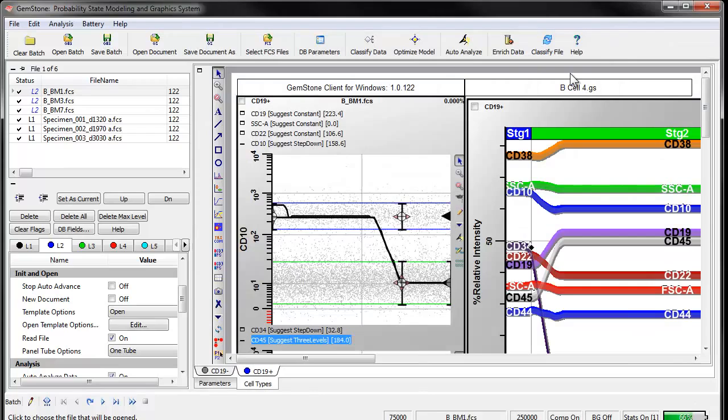And so that's done. Okay. But now when it gets to the next file, you see that's also on level 2. So if I leave it this way, it's going to reload that template and clear out the statistics, which is not what we want. We want it to accumulate as we go. So this is where we're really leveraging the levels, so to speak.